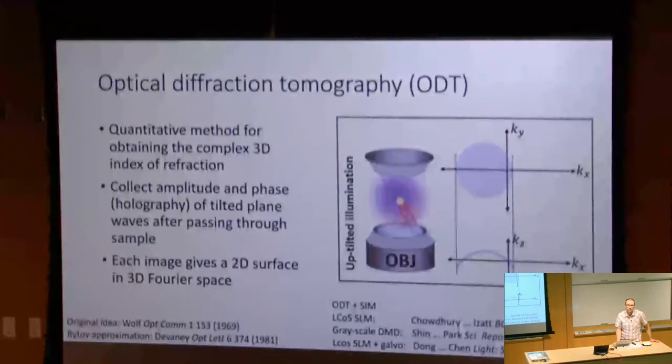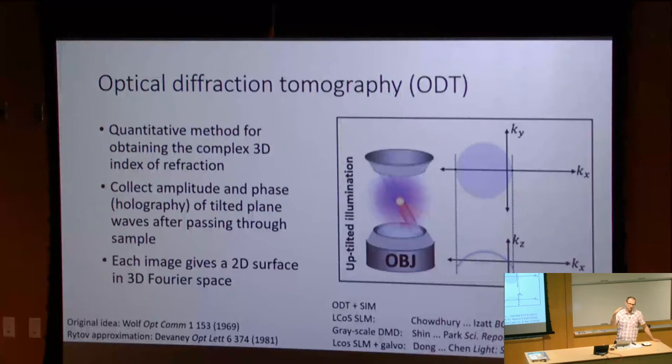On the same setup, you can also do optical diffraction tomography on the exact same setup. With this, you can do optical diffraction tomography at 1,000 volumes per second. You need about 8 images, is what we figured out in our setup, to fill in everything you need to do ODT. And this is non-fluorescent, right? Optical diffraction tomography is a holographic method, is the quickest, dirtiest way to explain this. We have to recombine multiple views, so the beam spins around, but we can generate that spinning with the DMD on the exact same light pathway. So we can interrogate the sample to get its phase at thousands of volumes per second, and then switch on the SIM when we need to.